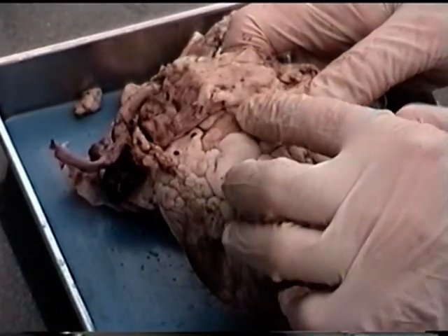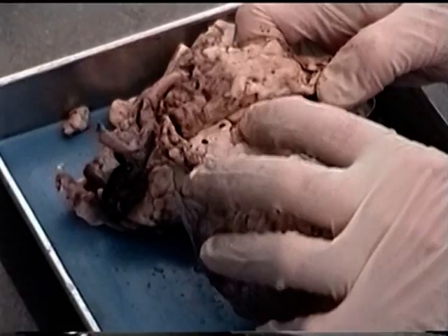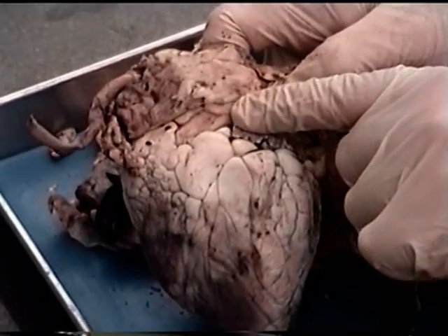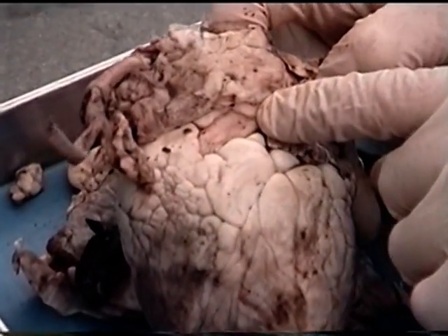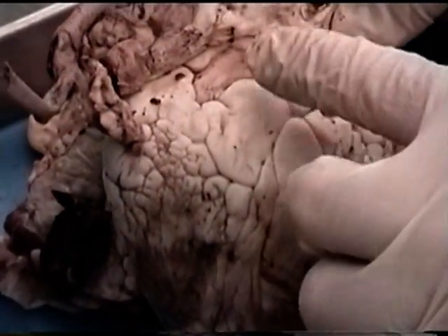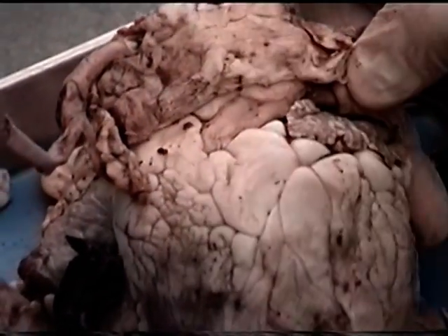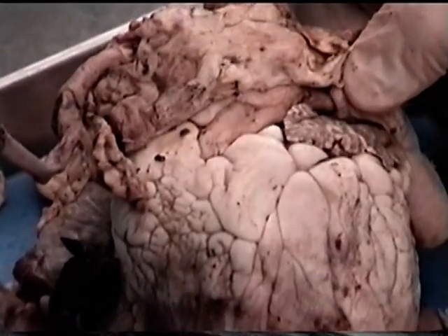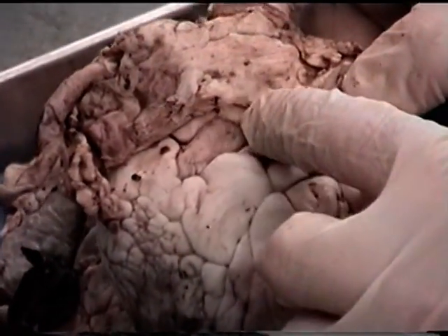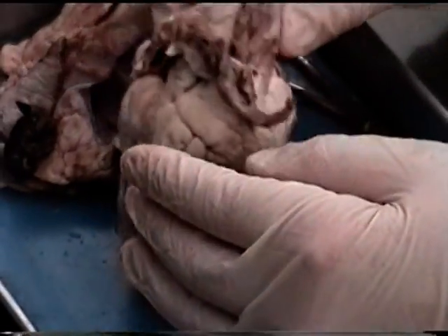so that confirms that this was the aorta. Now remember, on the model, just anterior to the aorta was another blood vessel that we see right here, which is the pulmonary trunk. The pulmonary trunk comes off of the right side of the heart. Once we find the aorta and the pulmonary trunk, we can begin to organize our heart into left and right sides and anterior and posterior. The pulmonary trunk tells us this is the anterior surface of the heart, and that this over here would be the posterior surface of the heart.